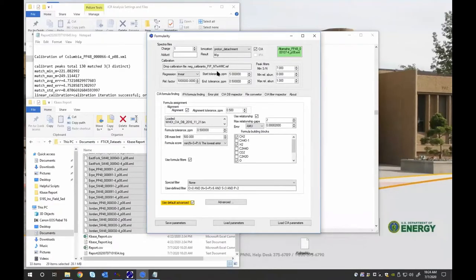And that result field is determined based off your ionization selection. So you can't change the result field. This will change based upon your ionization and what you have as your adduct. So for example, don't do what I'm about to do. If I change the adduct to a hydrogen, you can now see it's H plus M plus H minus P. So if that adduct is not blank, you'll have whatever the adduct is. If it's chloride or whatever, it will change.